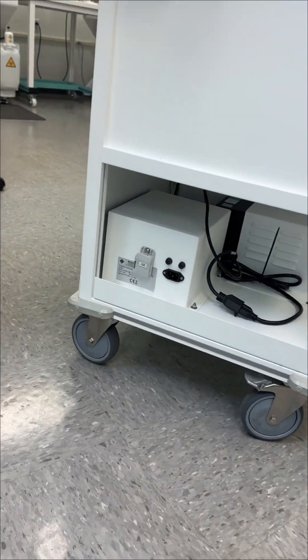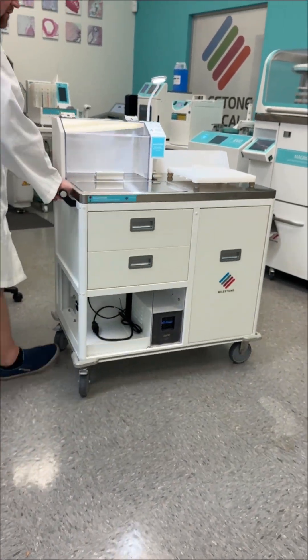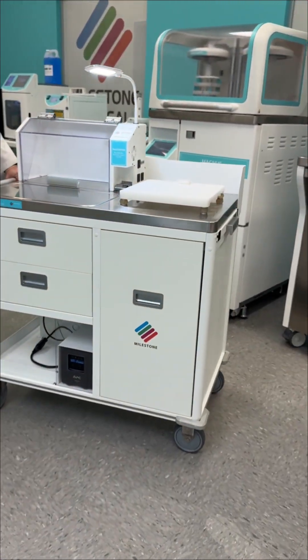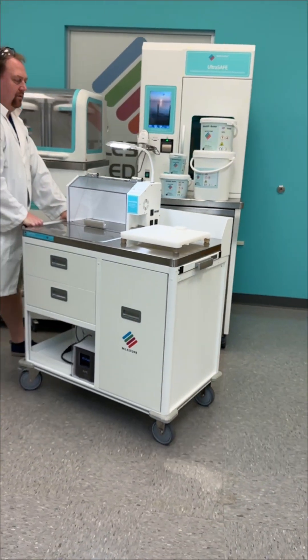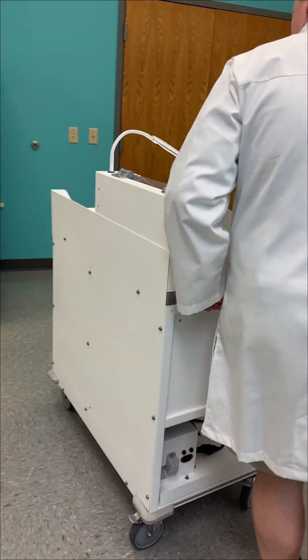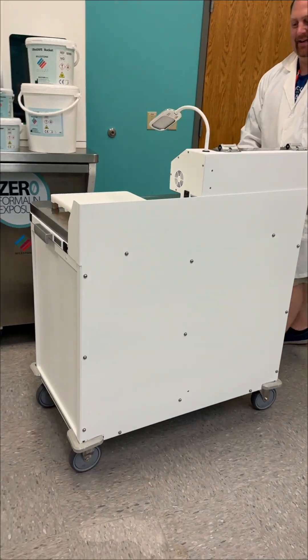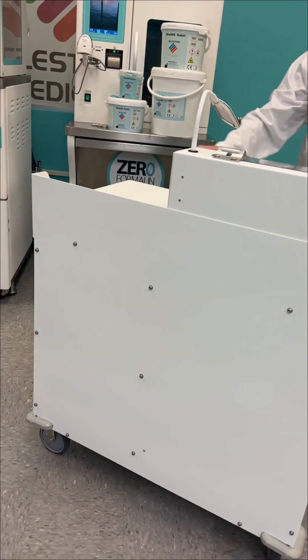Finally, the Rose Station is equipped with heavy-duty casters. These wheels make it easy to move the unit throughout your hospital or lab setting. Two of the casters are fixed, while two are turning wheels, which gives the unit solid mobility and stability. The Rose Station combines versatility, convenience, and mobility, giving cytology professionals a complete workstation wherever it's needed.